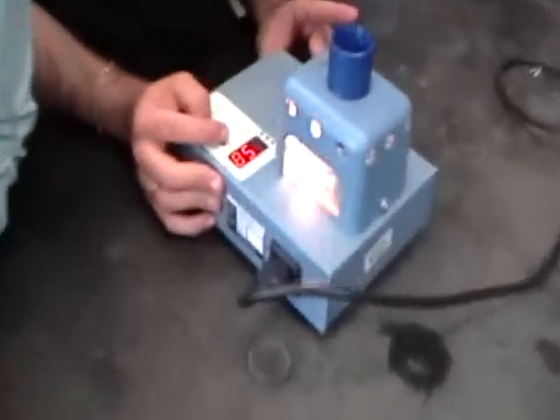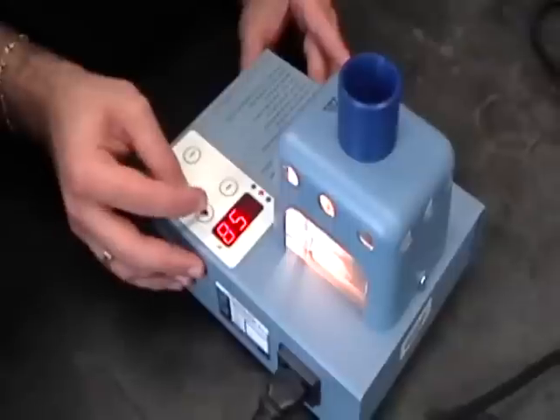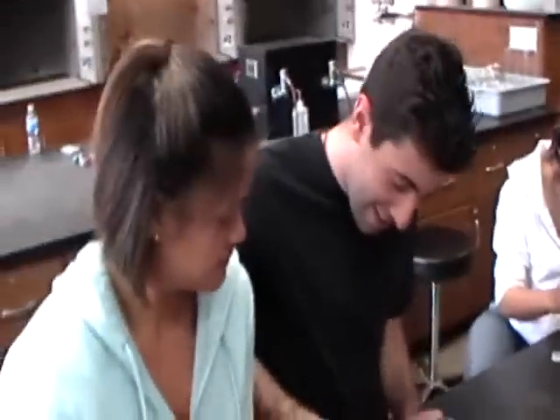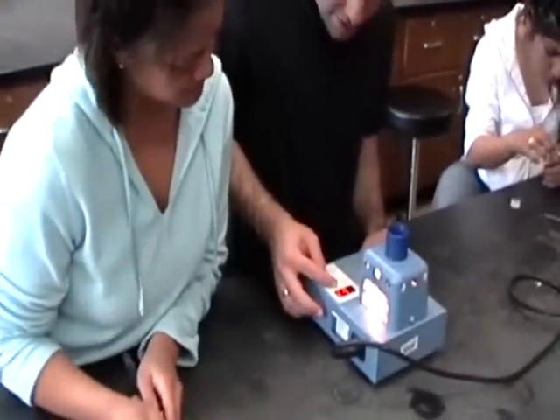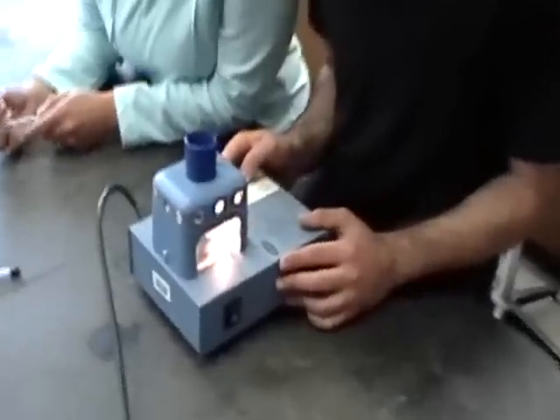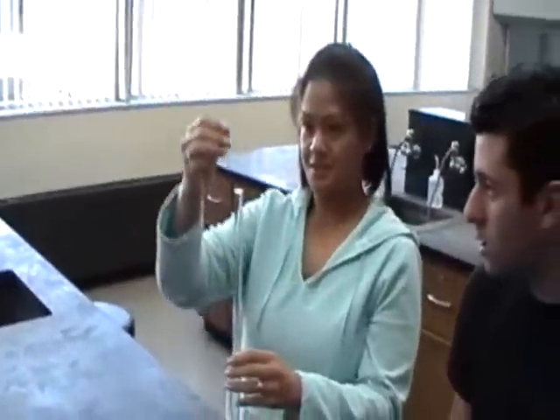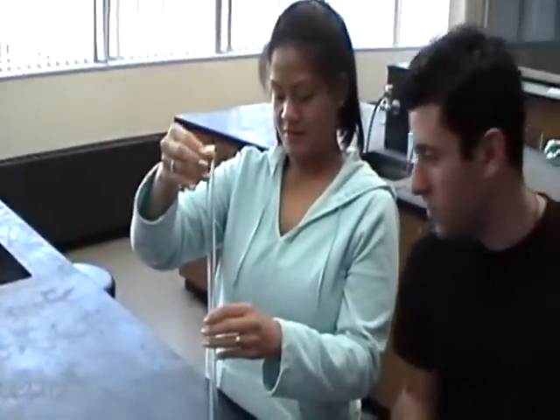We're going to set it to 70 degrees Celsius. Push the buttons, then set, and go until 70. Now push the substance down to the bottom of the capillary.